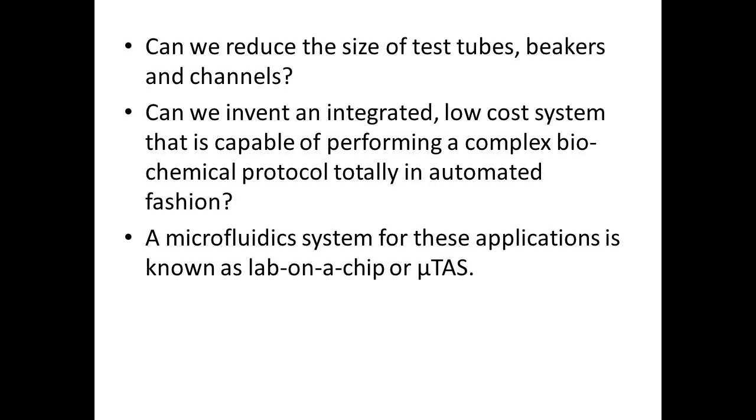For instance, now we have COVID-19 samples. We just take a swab of the patient or potential patient, and then we transfer it to the device of interest, for instance a PCR, polymerase chain reaction device, and we get our results.